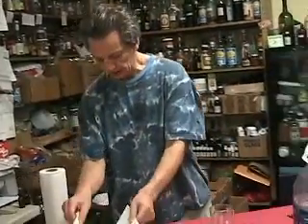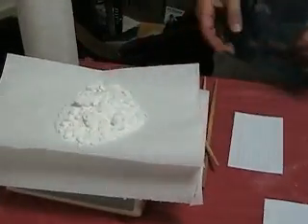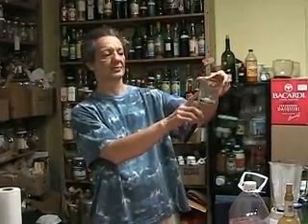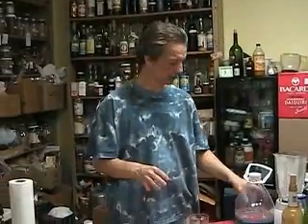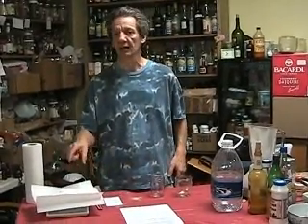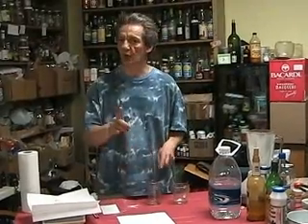So what we're going to do — I measured off potassium iodide before the show. I got approximately 170 grams, which is equivalent to 6 ounces. I'm going to try to do both metric and imperial, because not everybody knows metric and the majority of people who know metric don't have a clue what the imperial is. So we've got 6 ounces, and now we're going to measure off 1 ounce. We're going to put it in a container and saturate that solution to a point where it can no longer take the potassium iodide — close to maybe a gram, or 100 milligrams per one drop in solution. That's what we're going to try for.